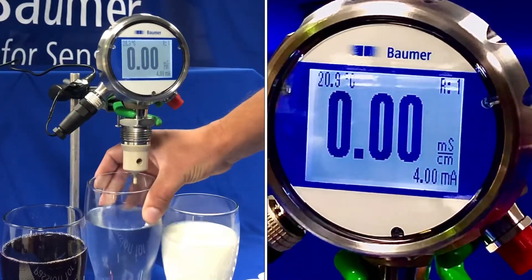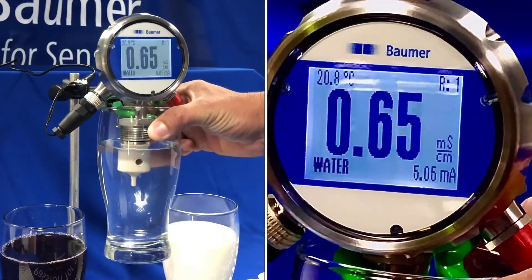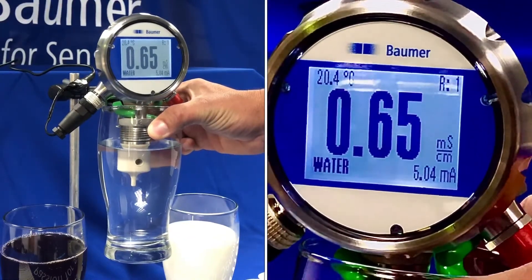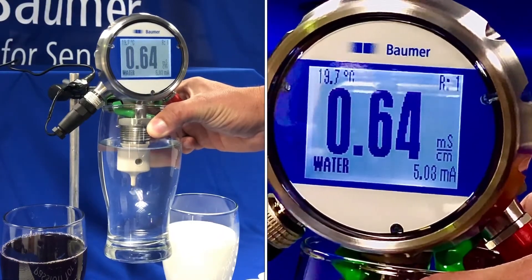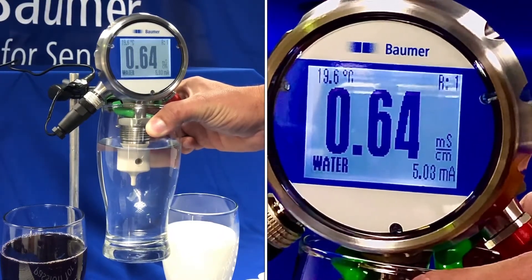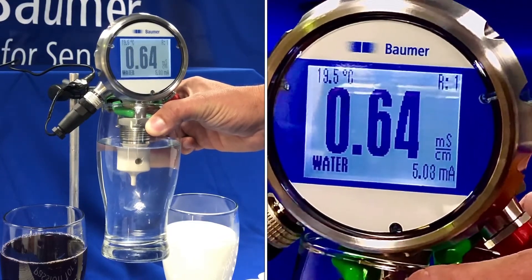If I introduce some water to the sensor you'll see the reading changes. We've got 0.64 millisiemens per centimetre, in the bottom left-hand corner we've got water labelled, and in the bottom right-hand corner we're reading around about 5 milliamps.